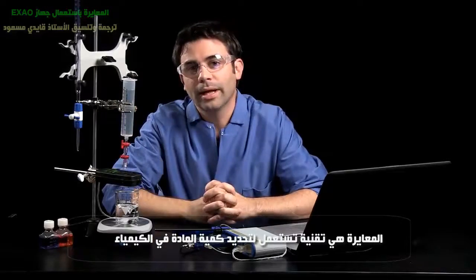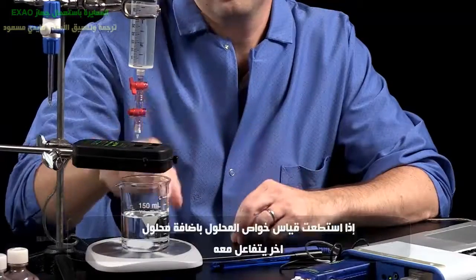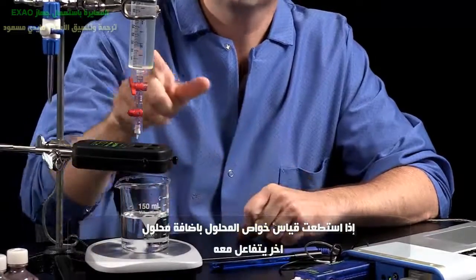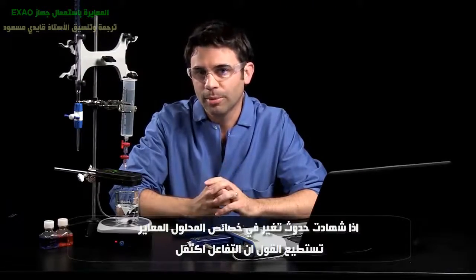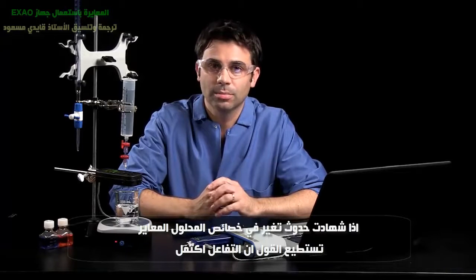Titrations are a valuable analytical tool in chemistry. If you can measure the property of a solution as you add some reactant to it, then when you see a change in that measurable property, you know the reaction is complete.